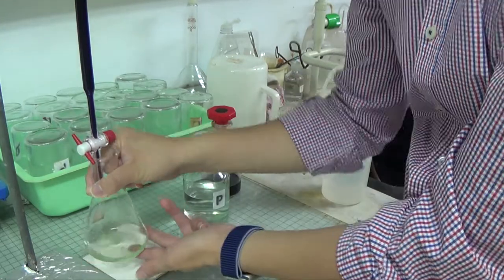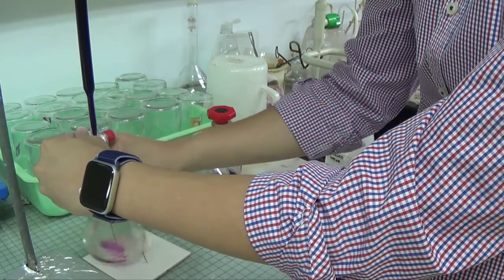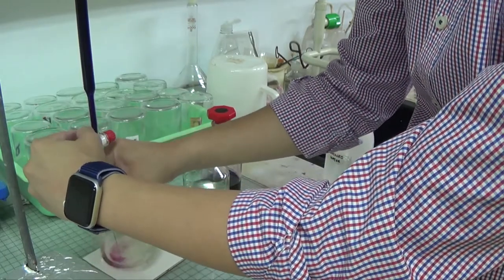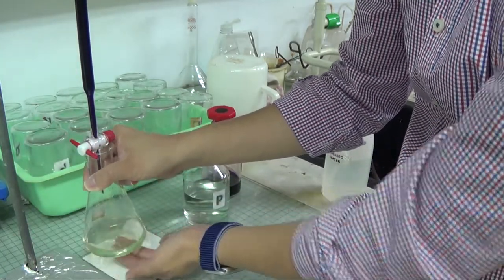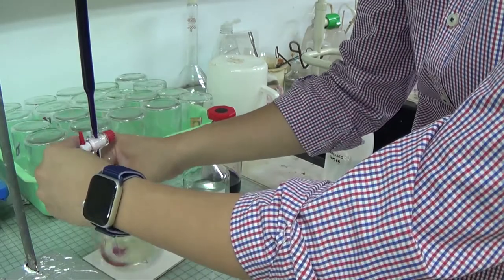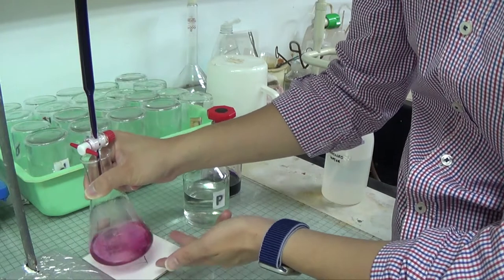As you can see, it's still colorless. There's no dark purple color yet. So it's still colorless. We are not too concerned about accuracy at this point. We just want to know roughly when to stop. As you can see, there's still no excess KMnO4. So it still goes clear, so there's no excess KMnO4, and as you can see, this has now stayed purple. It doesn't go to clear anymore.